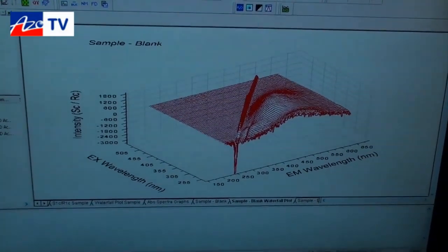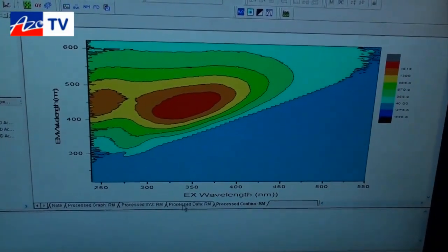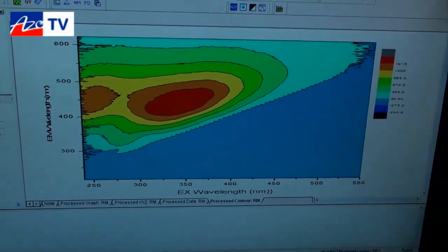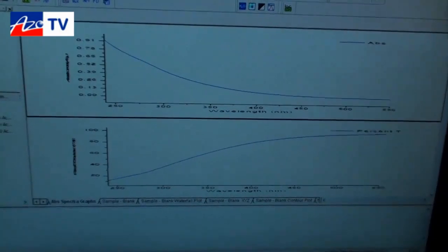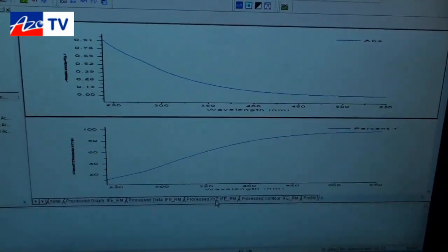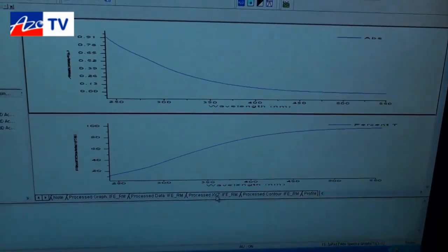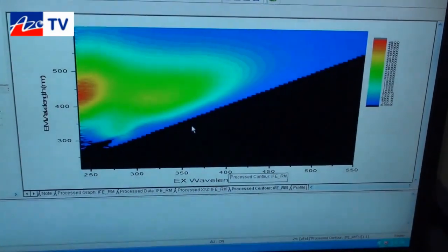So this is a raw picture of the unprocessed data. Then I'll walk you through some of the processing steps that we can apply. One of the processing steps involves the inner filter effect correction. And the inner filter effect correction can be followed by removal of the overlap band for the excitation and the emission. So we process the data and end up with a fully corrected spectrum.